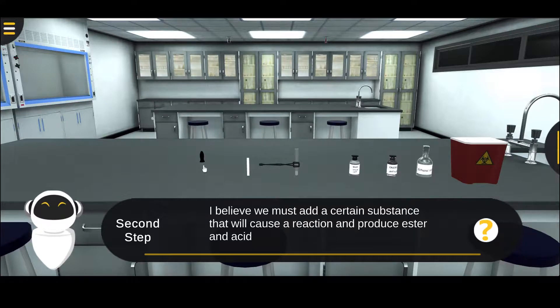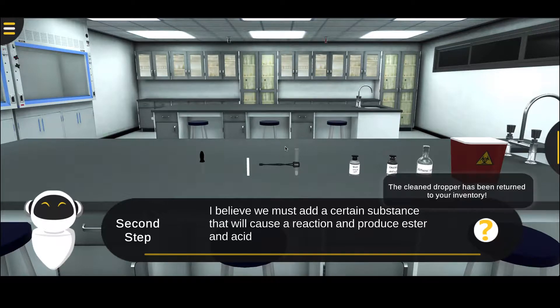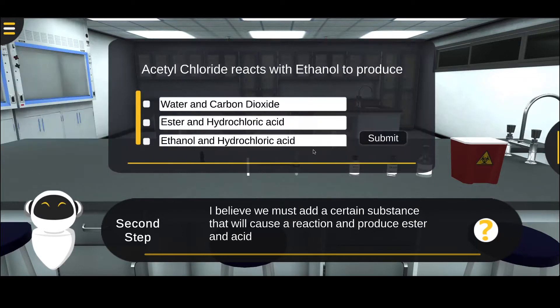Step three: empty the dropper contents into the waste bin. Step four: observe ester and hydrogen chloride gas formation as reaction products.